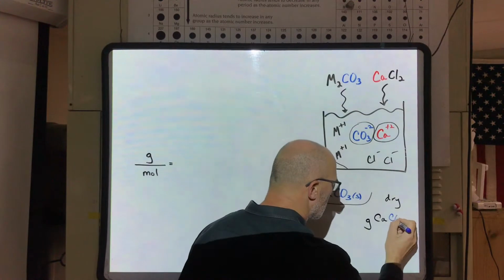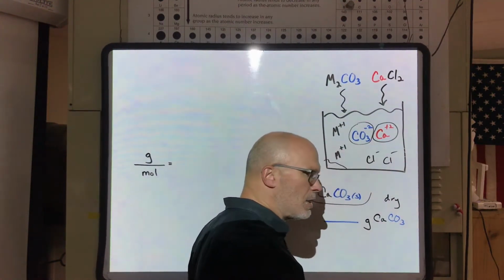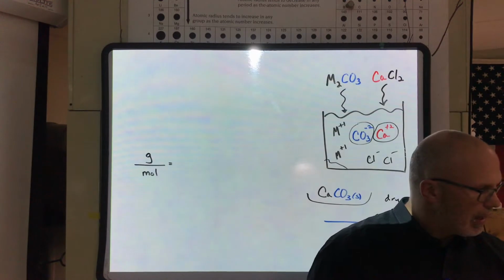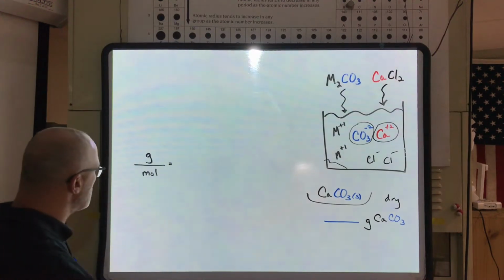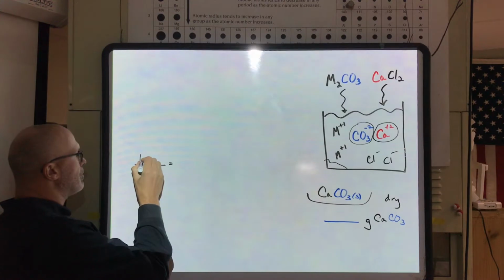Why not? Okay, so what I'm going to do is use sample A from my virtual lab that I made, and what I got, okay, was 1.36 grams was my original mass of my unknown sample.